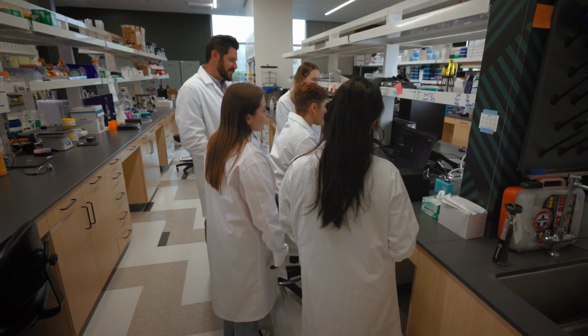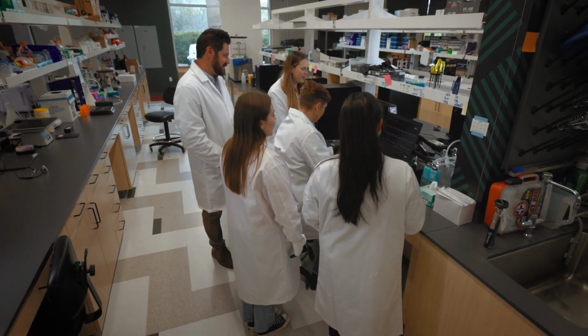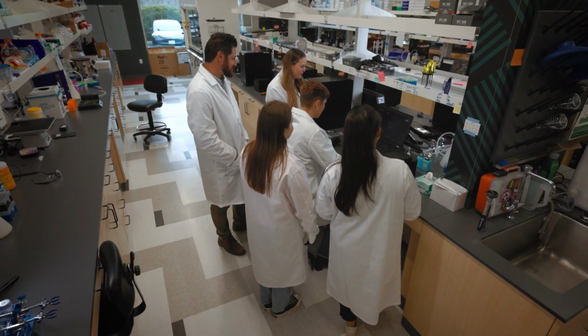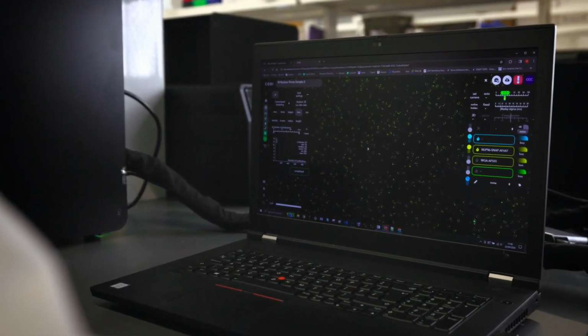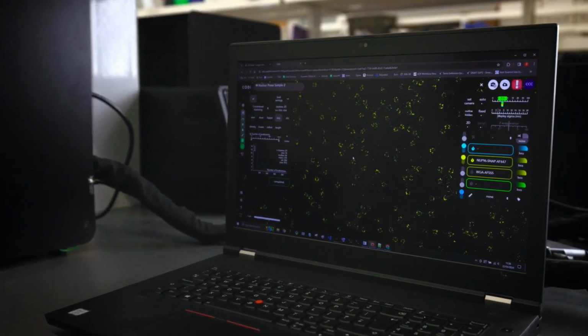The way that super resolution can really change how people think about their therapeutics and their research is it's really going to add that extra level of detail. Imagine suddenly you woke up one day and you could see 10 times more detail. There's so many new things you'd be able to notice. You might notice that maybe some flowers look slightly different than other flowers. That bee has a certain stripe that that other kind of bee didn't have. And once you can see that level of detail, you can start asking new questions. Okay, why does it look like that? Why is this molecule in this part of the cell? So once you can see more details, you're able to ask more questions and get even better answers.